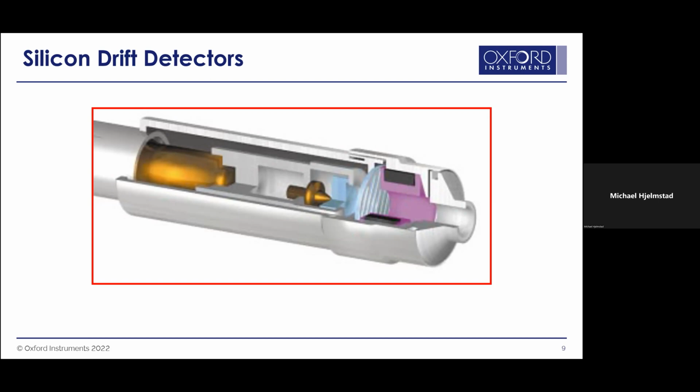Obviously, you have to have enough counts to form a considerable peak, but it's not something that you want in there at all. Electrons have nothing to do with this technique. So we put in an electron trap, so to speak. It's merely a magnet, just a means of pulling them out of the circuit.